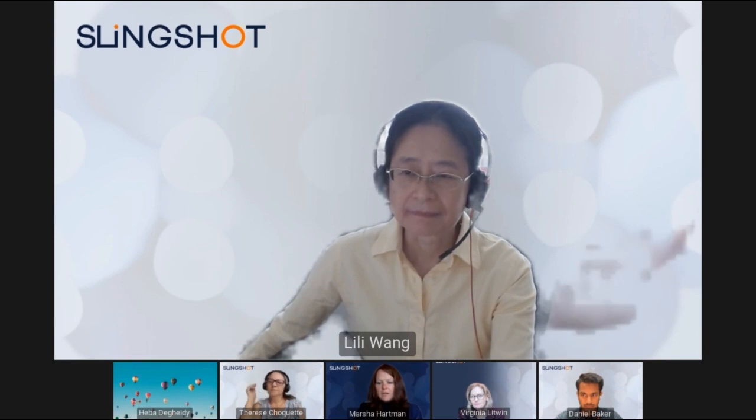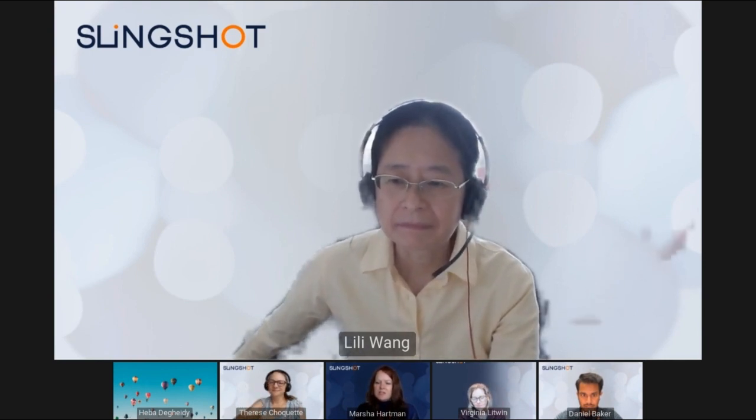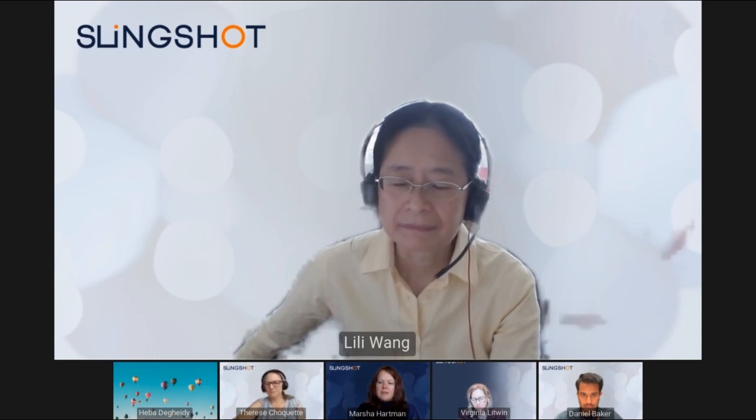Thank you, Hiba. Very nice answer and very accurate. And with that, I'm going to kick it back to Hiba because controls are necessary. Leanne says, nice presentation. Using the slingshot beads for linearity is a very interesting approach. I want to make sure I understand what was done. You use the slingshot product with the antibodies alone to see if the reagents are performing with linearity, so more of a device control for the assay and not the linearity of the assay in context of a product. If you, Therese, don't mind addressing that question, I can repeat it if needed.